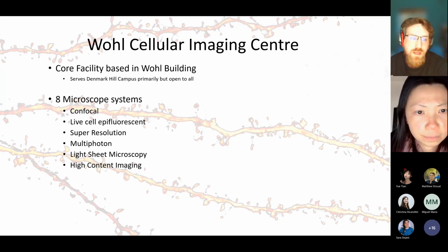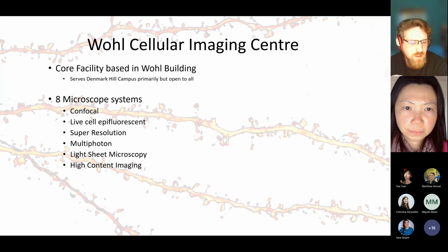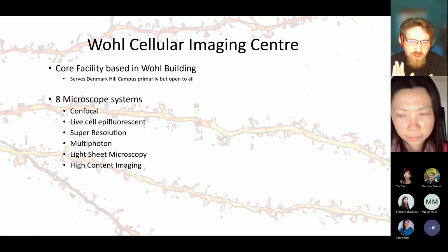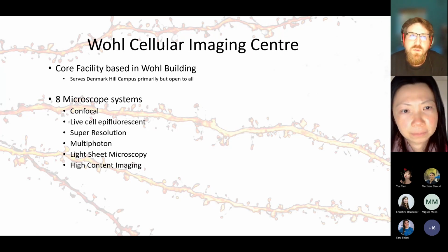And then the stains that you use, it broadly varies. Alexa 647 as a fluorophore is an ideal choice to always try and use because it's very easy to get blinking. The antibodies, however, that you choose to use, the standard antibody size is about 20 nanometers, which is actually the resolution of the system itself. So if you're using a primary and then a secondary, you might have your localization off target as such. So you will want to try and either conjugate the fluorophore to your primary, where possible, with covalent bonding, or try and use a nanobody.